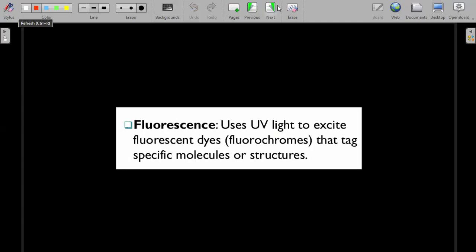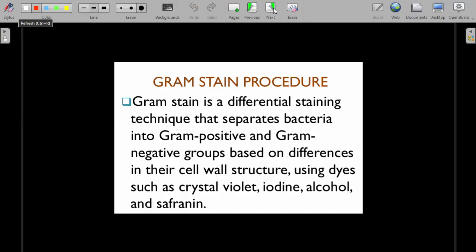Okay, so I'll quickly go to the last part of the tutorial, which is about staining. Now we said that when viewing microorganisms on a microscope, we usually use stain, and staining helps us to differentiate the microorganisms, isn't it? So one of the stains we can have is called gram stain. This one is used to differentiate between two types of bacteria.